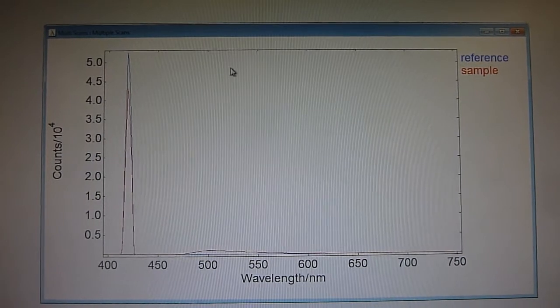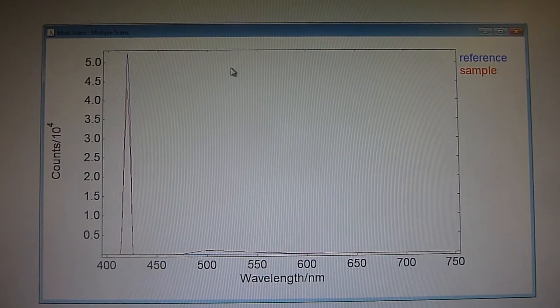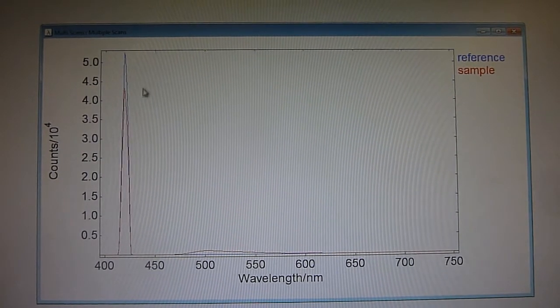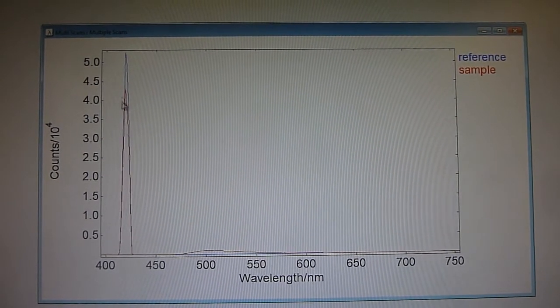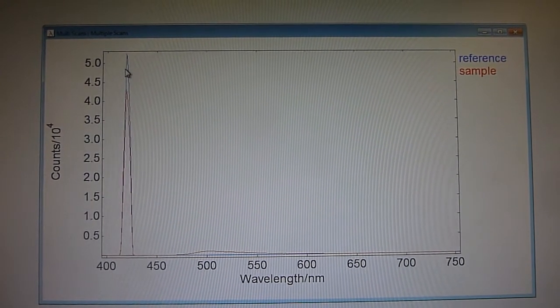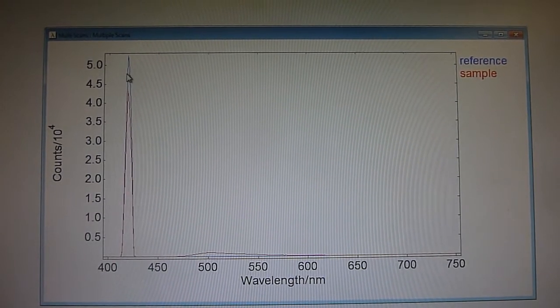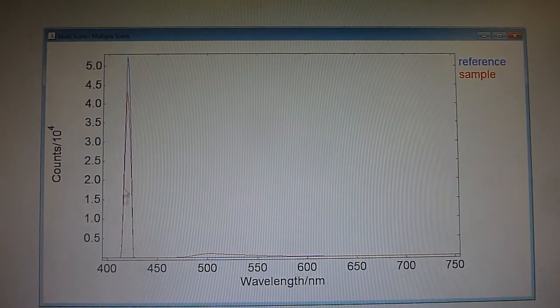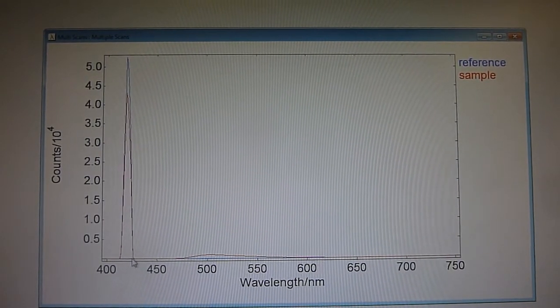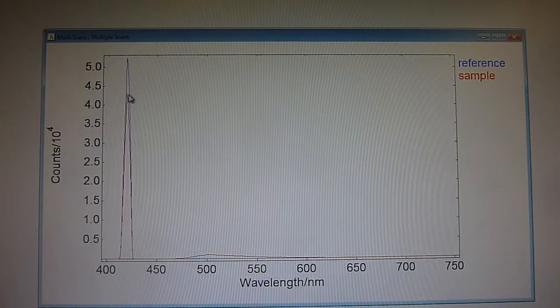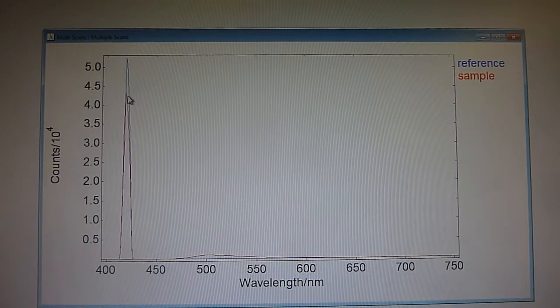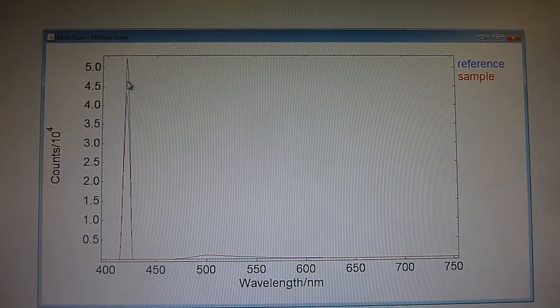Here I'm looking at the F900 software for the FLISC 920 and we're going to be doing a quantum yield measurement. Right now I have two graphs combined. One is with the sample in the integrating sphere and one is without the sample or it's with the reference sample. This region here in between 400 and 450 is the scattered light with and without the sample, and the difference in the two curves here represents essentially the absorption by the sample.